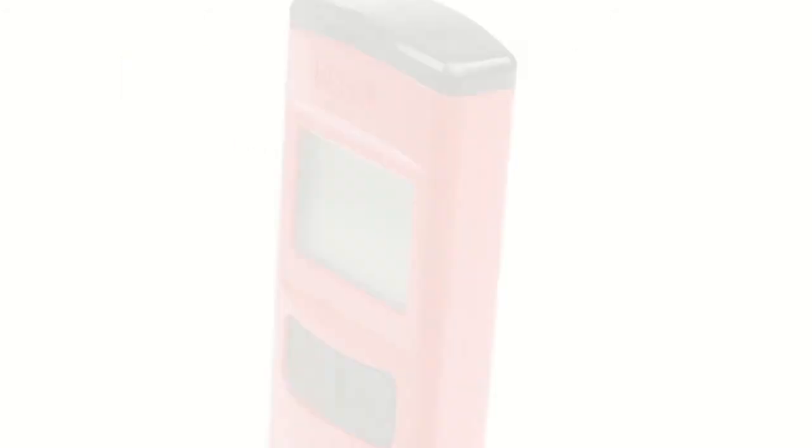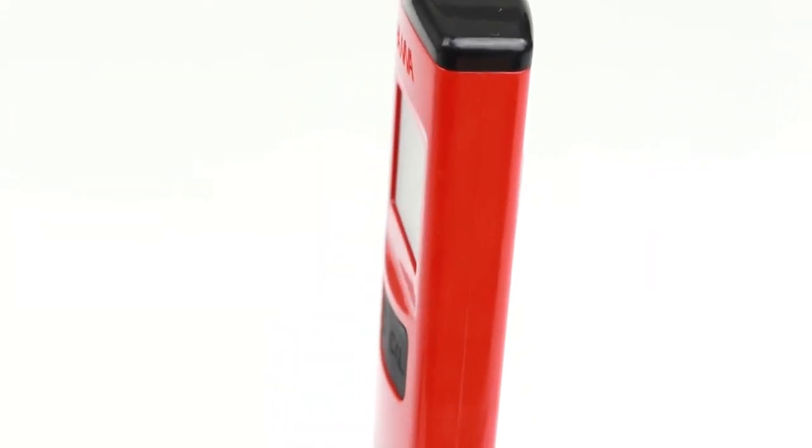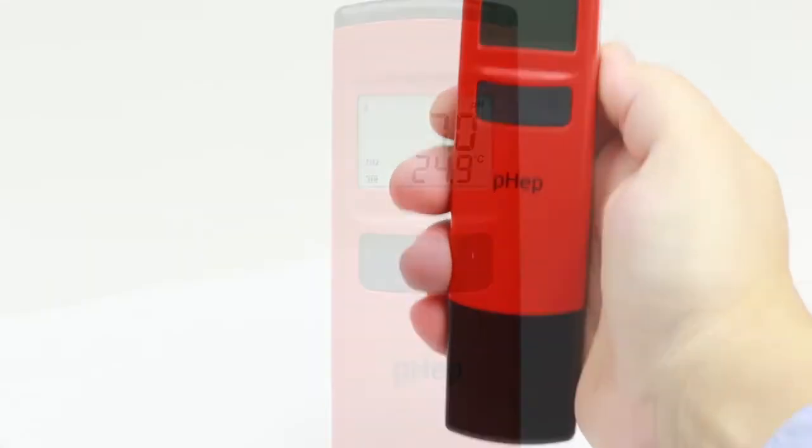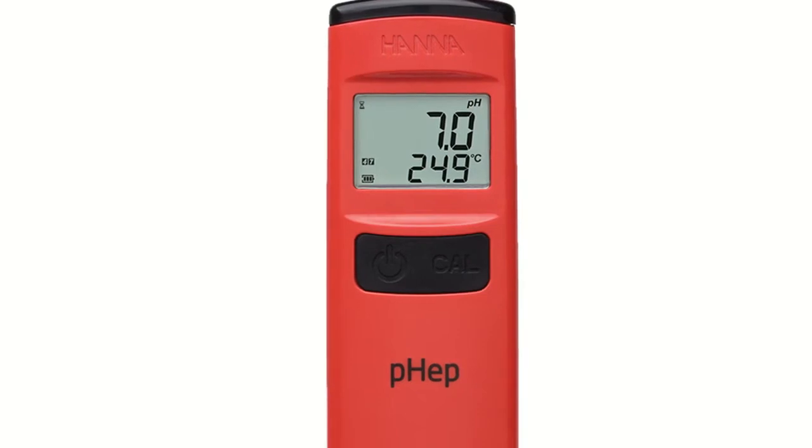The pHep meters are designed with accuracy and simplicity in mind, starting with a slim ergonomic design that fits comfortably in your hand, and a high contrast, large display that is easy to read.